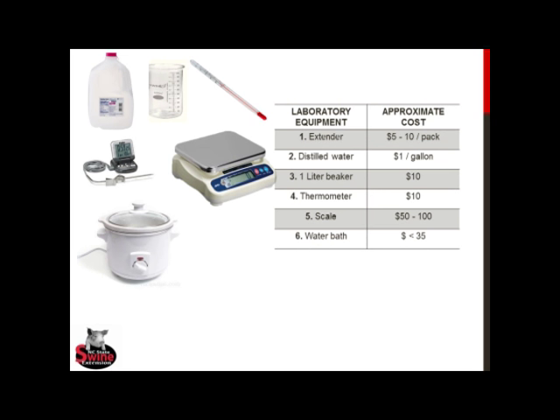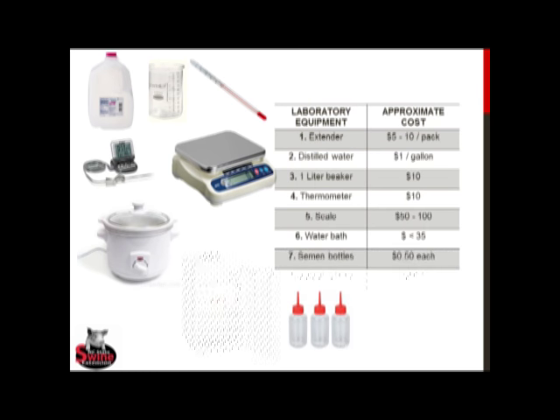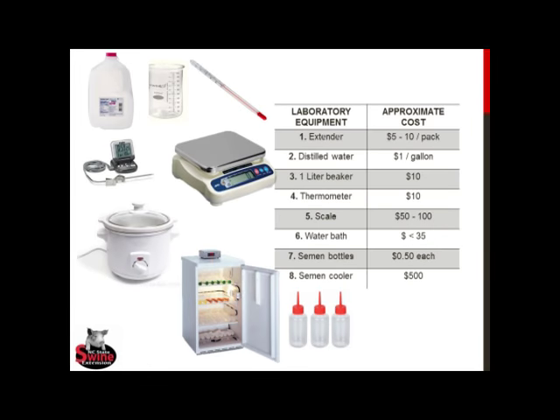Another option is to heat the extender solution to the desired temperature and place it in a good insulated cooler until it is needed. Remember, though, that failure to maintain the proper temperature throughout extending is one of the largest causes of poor semen fertility, and so producers should check the solution frequently to ensure it is at the correct temperature.